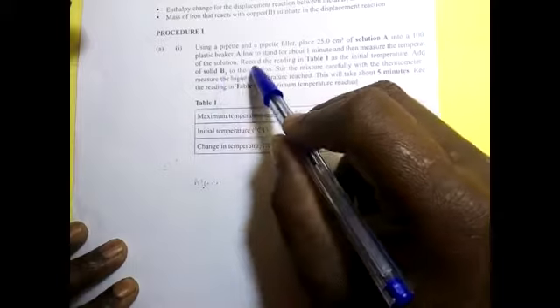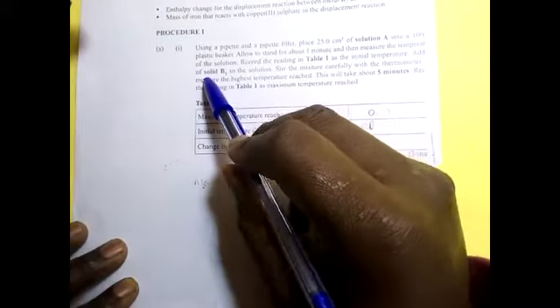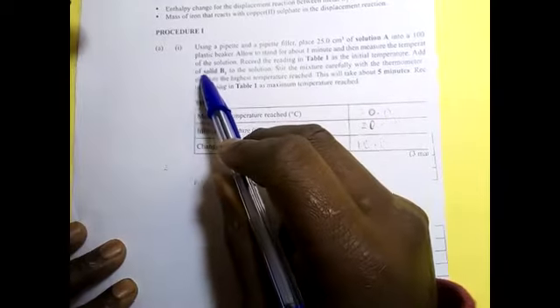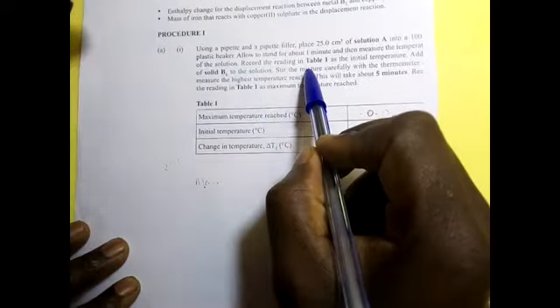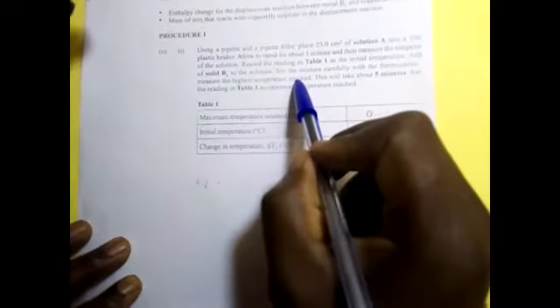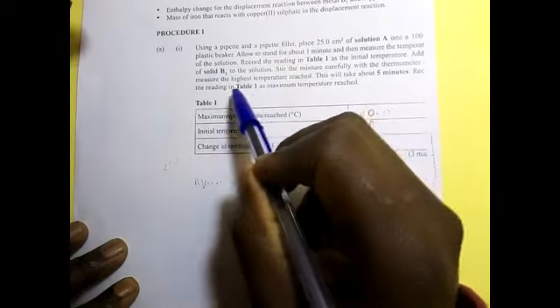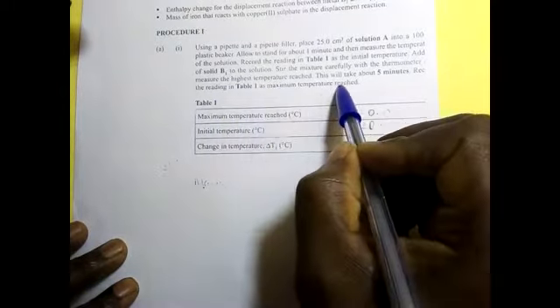Add all solid B to the solution. Stir the mixture carefully with the thermometer. Measure the highest temperature reached. This will take about 5 minutes. Record the reading in table 1 as the maximum temperature reached.